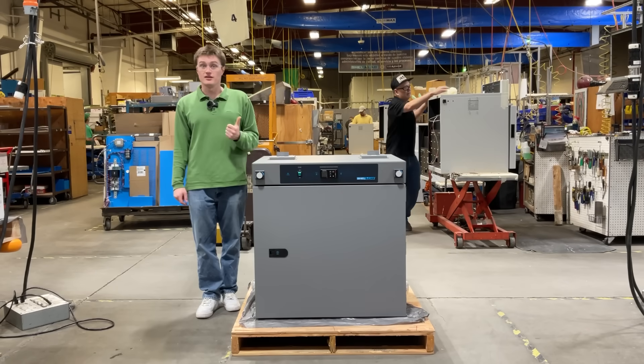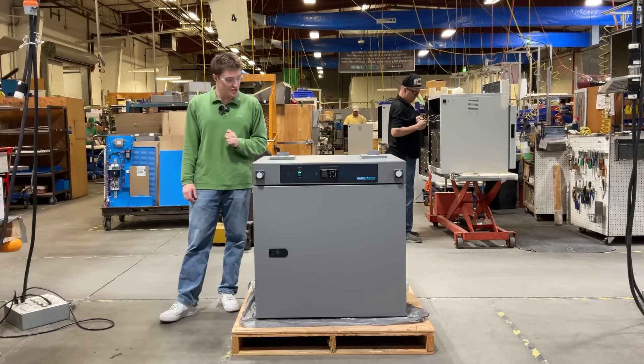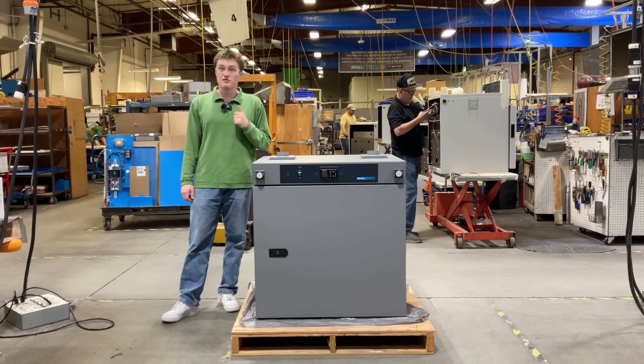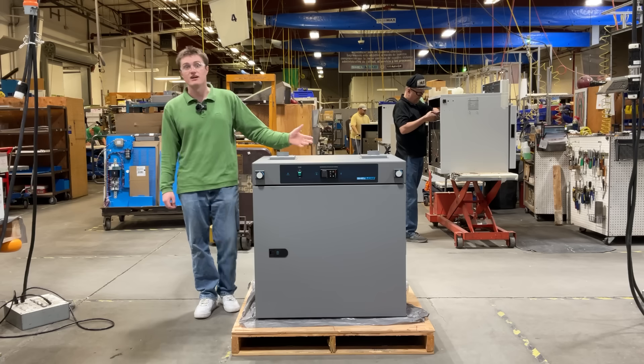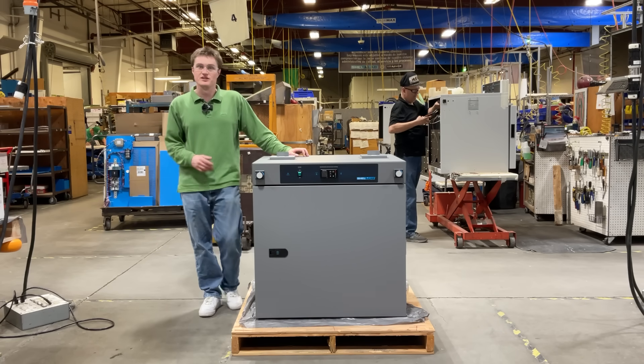This product is trusted by professionals in research and testing laboratories, manufacturing, and industrial use, as well as the fields of pharmaceuticals, biotechnology, aerospace, and electronics. When precision, efficiency, and reliability matter most, SHEL LAB SMO5HP-2 High Performance Forced Air Oven is the ultimate choice for your needs.